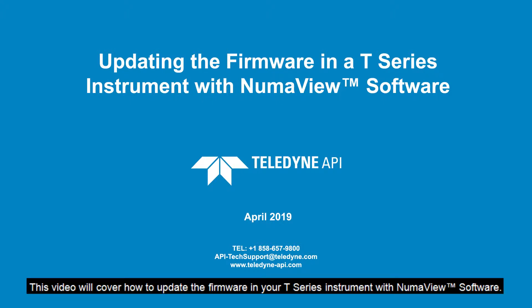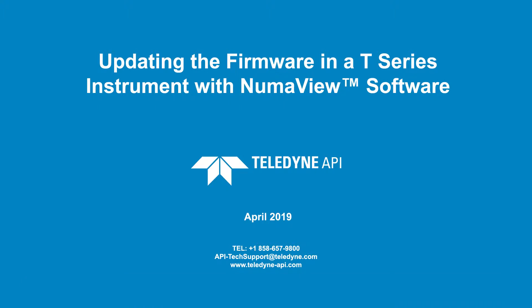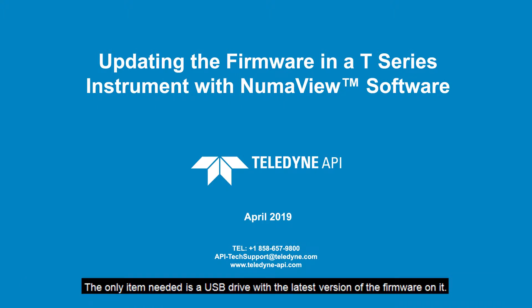This video will cover how to update the firmware in your T-Series instrument with Numaview software. The only item needed is a USB drive with the latest version of the firmware on it. To get the latest version of the firmware, please contact TAPI Technical Support.